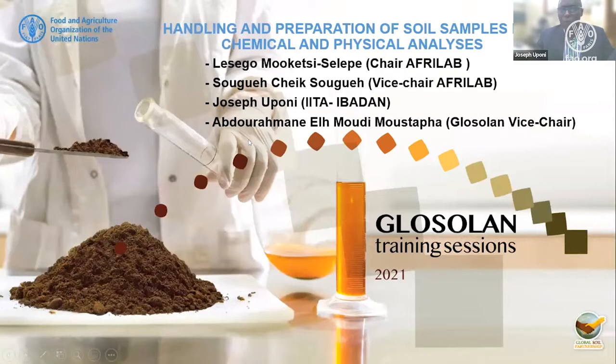Right from the beginning, I want to emphasize the importance of sample preparation and sample handling. If your samples are not well prepared, no matter how accurate your instruments are, no matter how well trained your personnel are, you will already be getting false results. And that's why this is so fundamental to the quality of soil and plant analysis. Though it's so basic, yet it is the foundation on which the quality of any result we are going to get is based. So I expect that we take this very seriously.